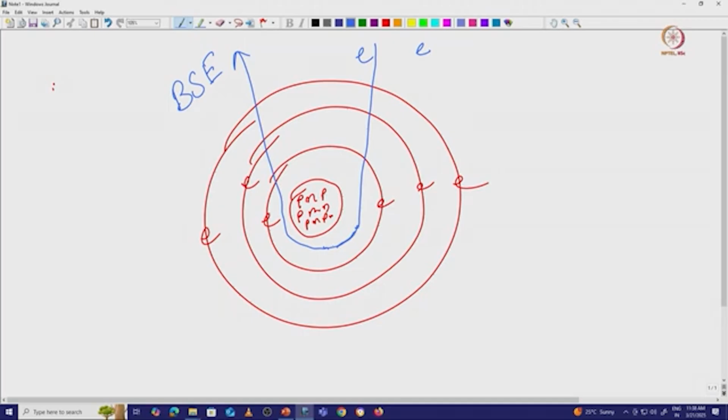This kind of backscattered electron may interact with the other electron and lose its coherent property. So, what do we mean when we talk about a coherent electron beam? It is good to know. If there is an electron gun, we always expect that all the electrons start from this point. They should not come from any other point.